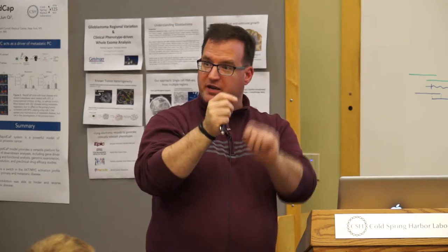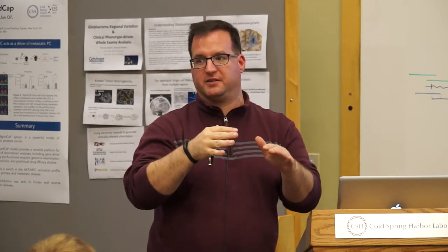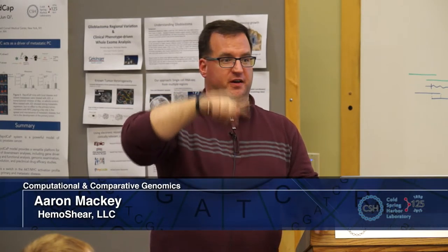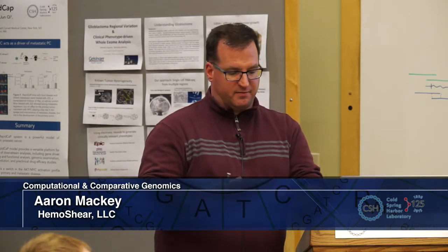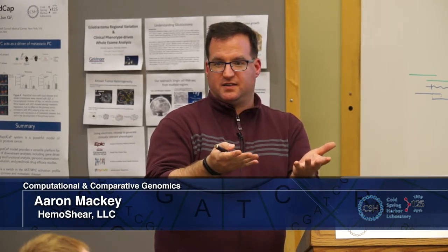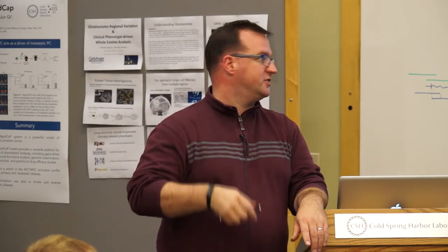And if you could just stick a tiny pH meter into each of those million different wells, then you could measure the amount of pH change at each cycle. Then at the end of the cycle, you would float in some neutralizing buffer and put it back to where it's supposed to be and go on to the next cycle. So that same flowgram I showed you, where you were measuring the emission of light by luciferase, you can instead measure a delta pH. That's exactly what Ion Torrent does. It uses a silicon wafer that has an electronic circuit exposed to the fluid and has individual microscopic pH meters that in every single well measure the pH flux at each cycle.